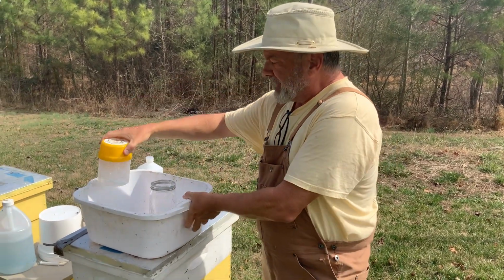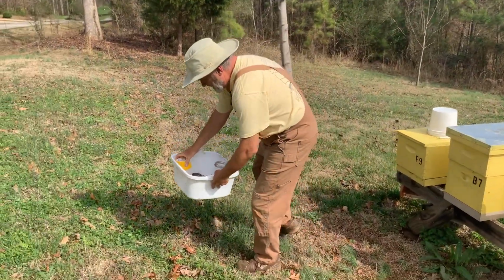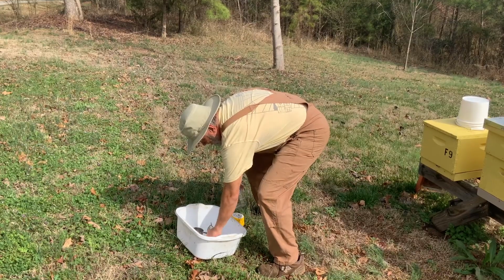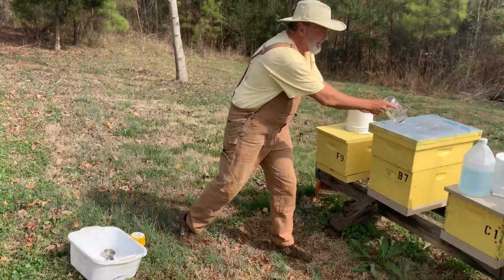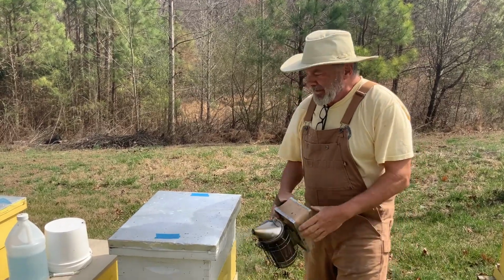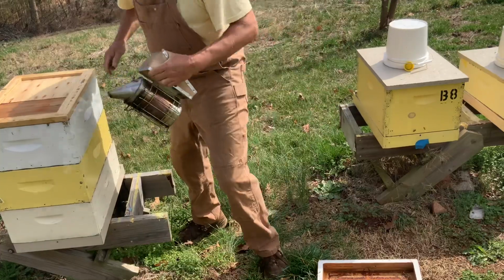And then I can take all of this and set it away from the hive so that when I do my sample, I'm not doing it right in the middle of where all the bees are at. I can take these and set them on another hive. So to get started, we're going to smoke and open the hive. I'm going to set my hive cover here in front.